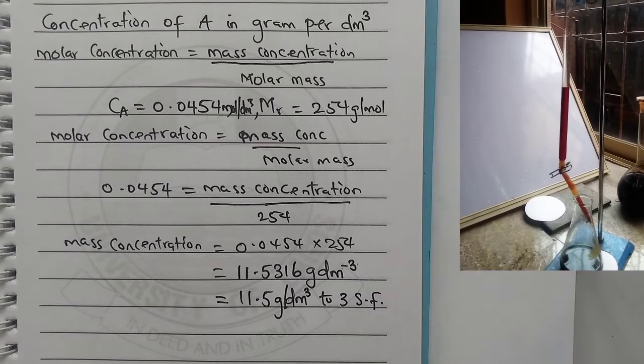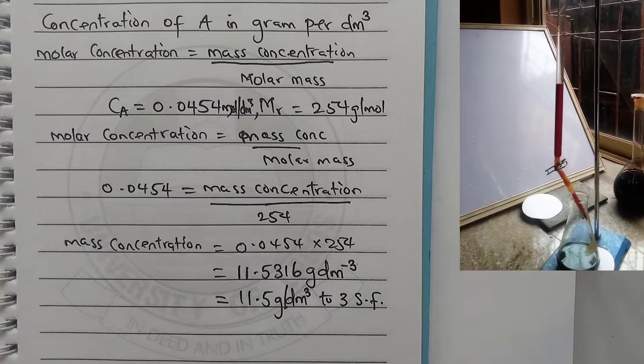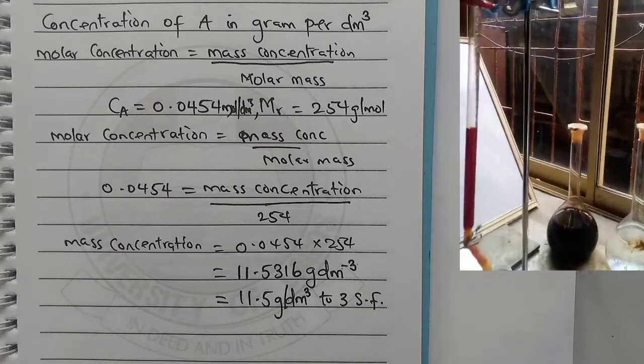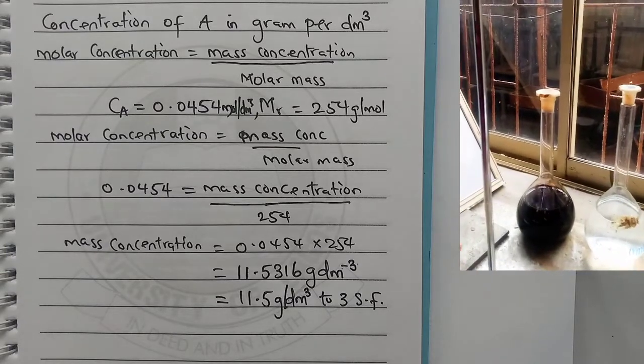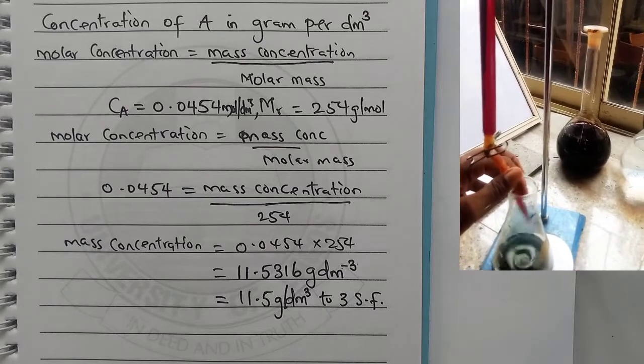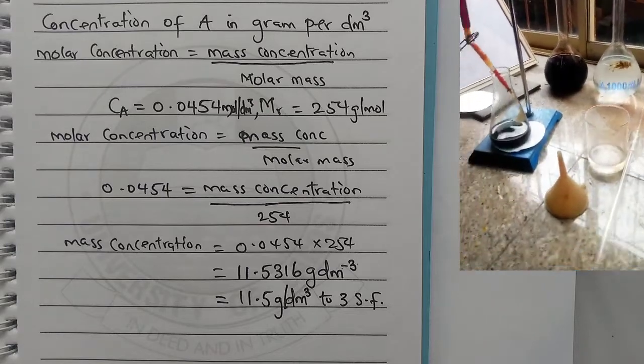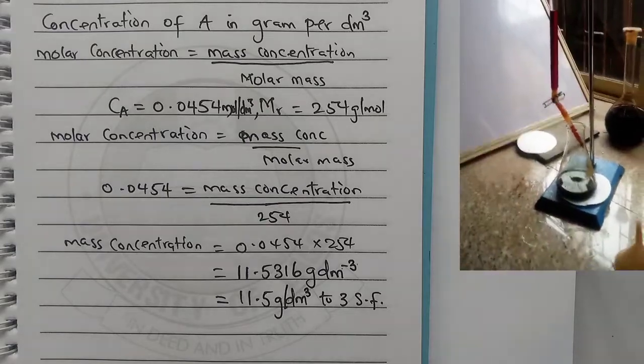The other question is, why is starch solution added towards the ending point of the titration? The reason is that there was no iodine present in the beginning, therefore the starch will not have an effect. As we start to have iodine coming up, that is when we will start to notice.